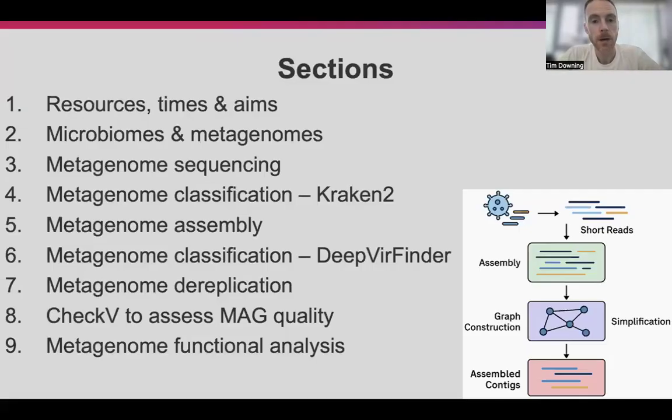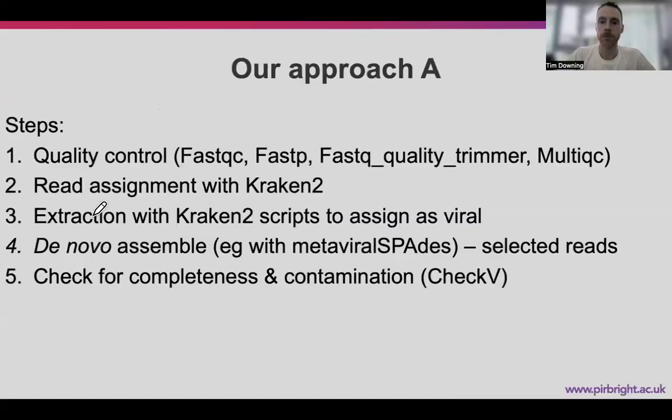Welcome to video 3 in our course G08 on metagenomics, particularly applied to viruses. Here we're going to look at metagenomic classification, taxonomic classification approaches, mainly focusing on how we're going to do it in a lab with Kraken 2.